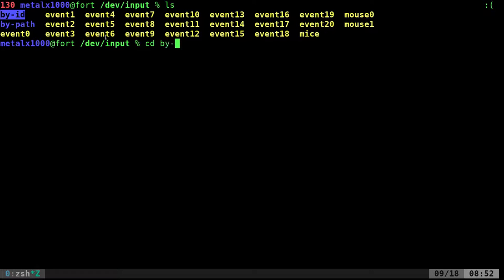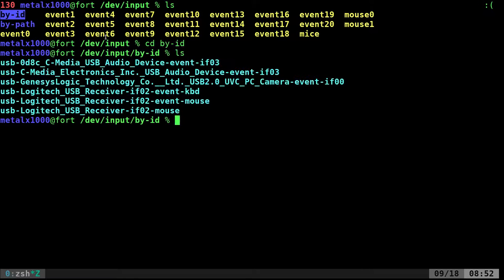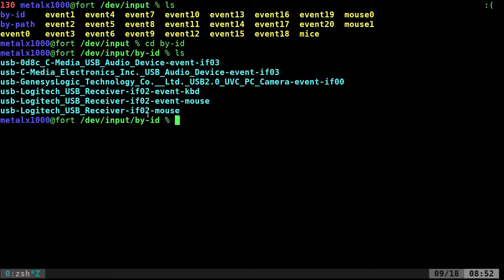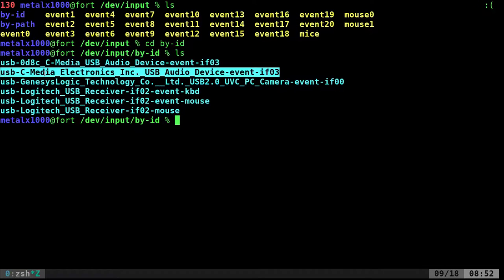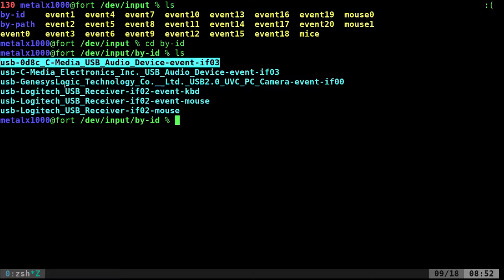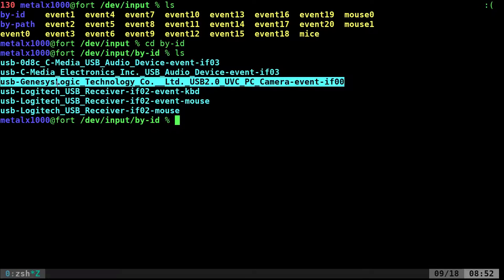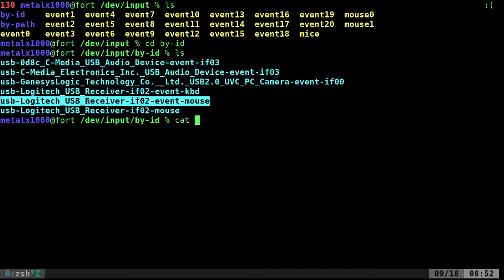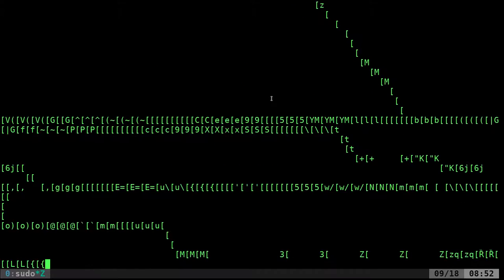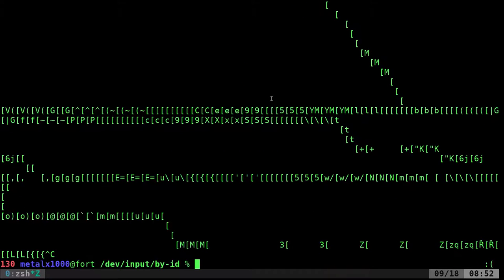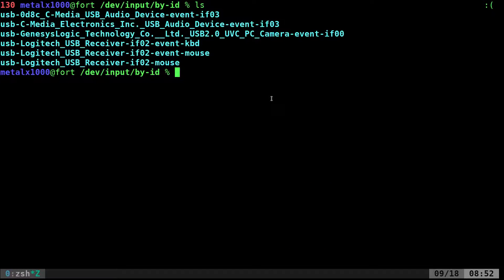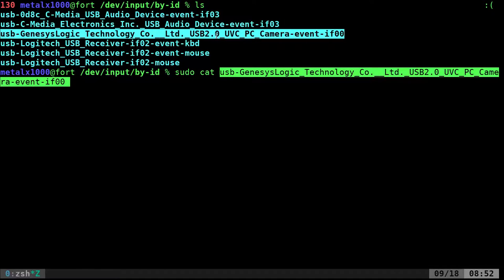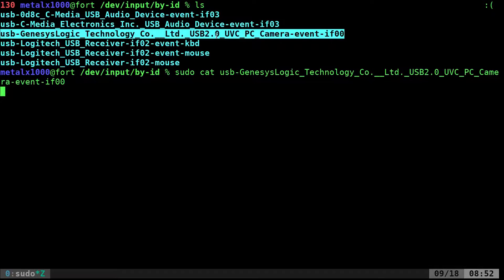So theoretically I should be able to sudo cat this. That would be my mouse. If I list out and cat out sudo cat this device and hit enter, you would think I would be able to press those buttons and get information.